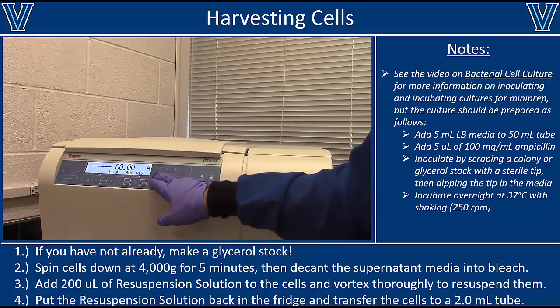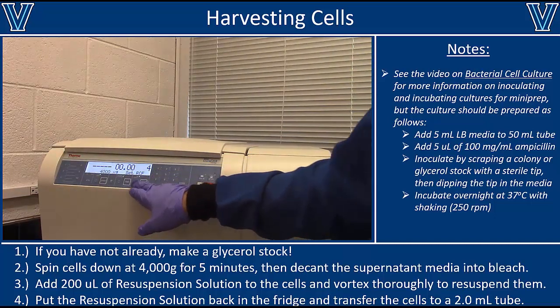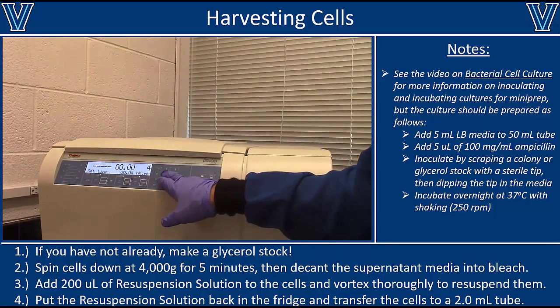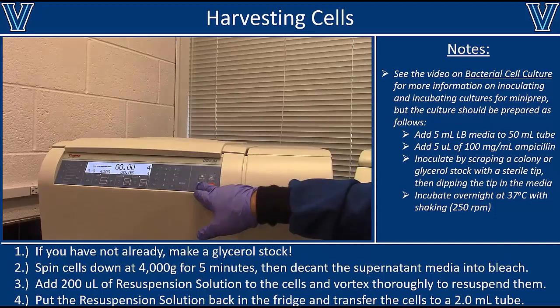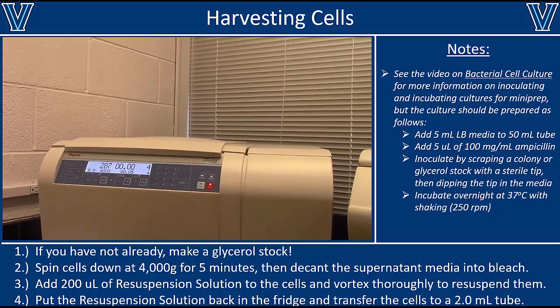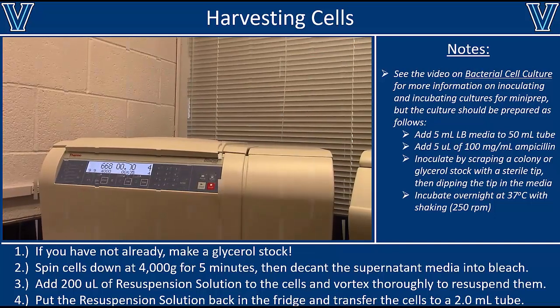For 5 minutes. Now, depending on your centrifuge and the rotor you're using, you might have to increase the speed or increase the time. Some rotors have maximum speeds that are much lower, so if you had to centrifuge for, let's say, 2000 G, you might want to double the time to make sure you're pelleting all of the cells.